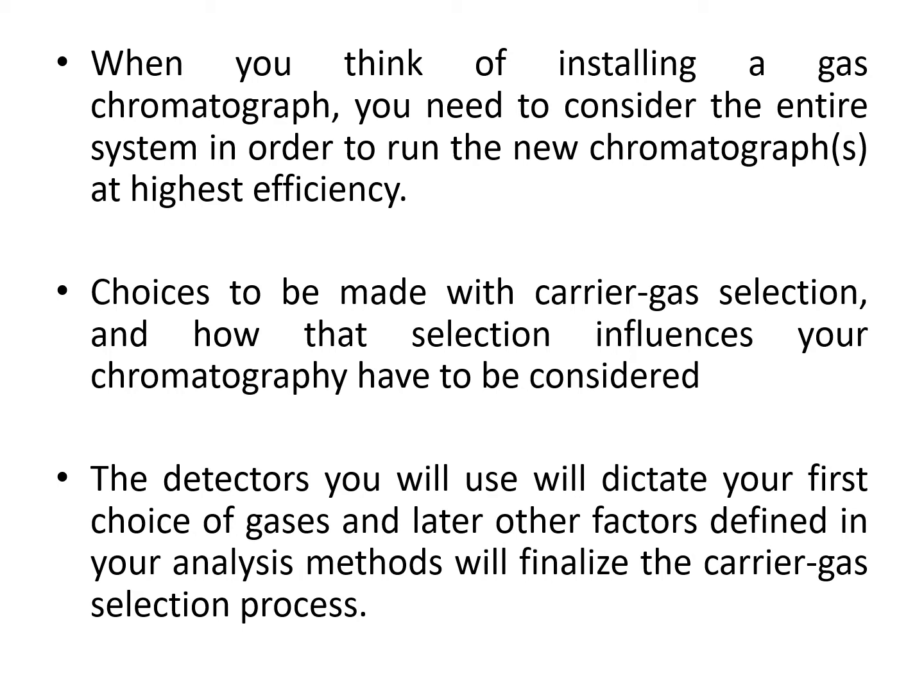Choices to be made with carrier gas selection, and how that selection will influence your chromatography, have to be considered. The detectors that you will use will dictate your first choice of gases, and later other factors that define your analysis method will finalize the carrier gas selection process.